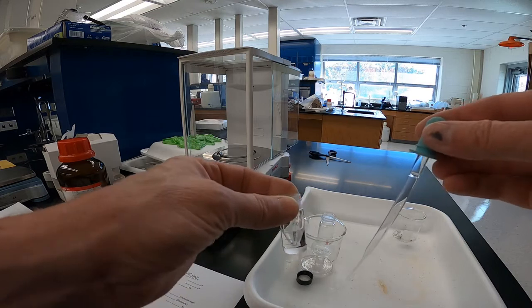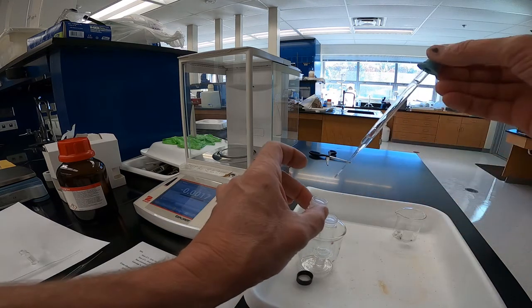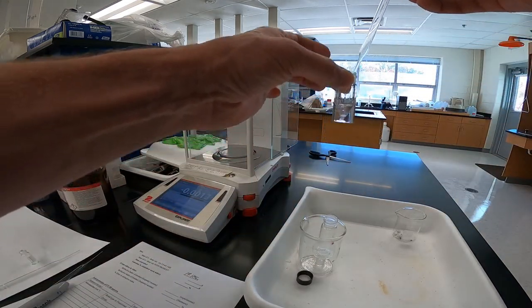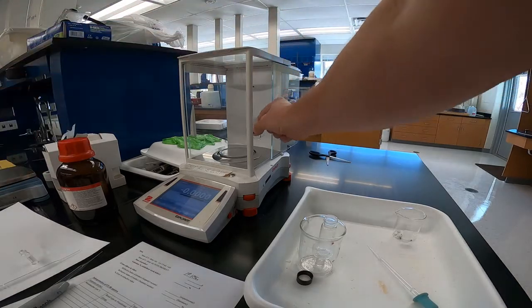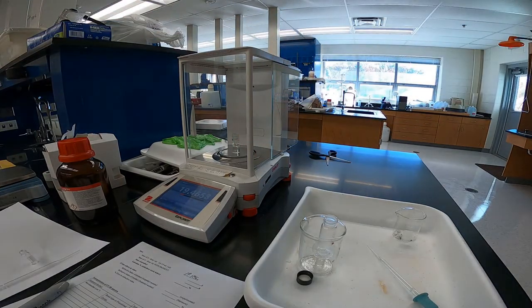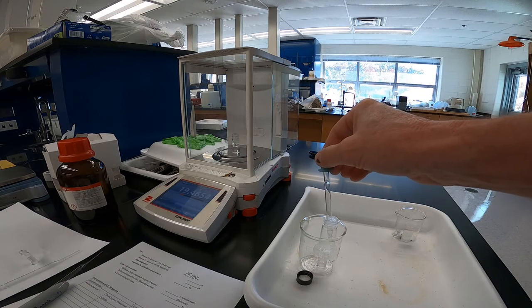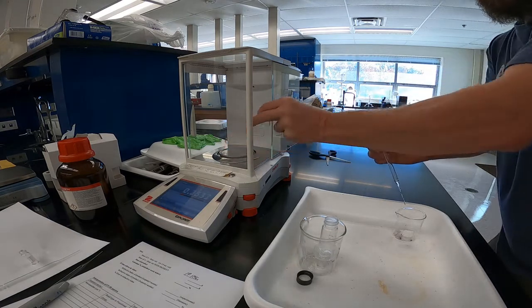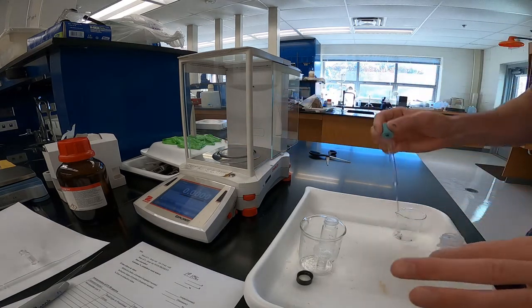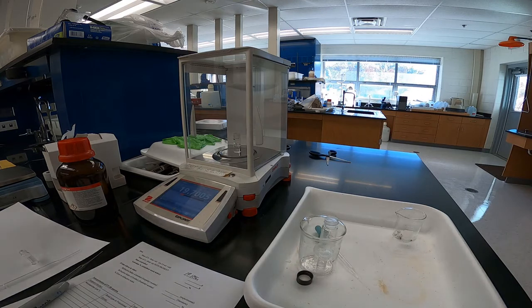So all I'm going to use is a glass pipette, and you can put it down inside the vial, draw out the liquid, and add it to the vial. I'll try to get a little bit more out of there. The last bit. It's hard to collect every last bit from the distillation process unless we do this several times. But we started with a milliliter of reactant, and our product is actually a higher molecular mass. So we should have less than a milliliter, or roughly less than a gram.